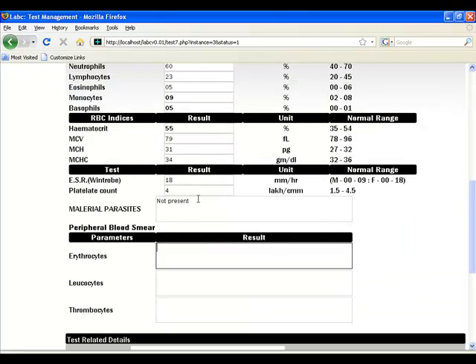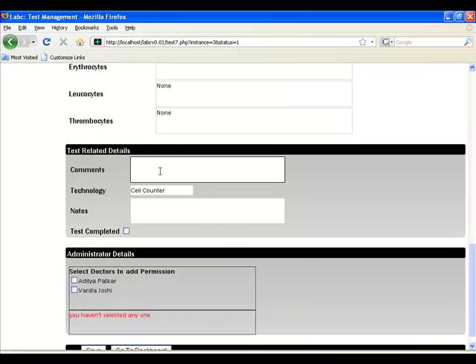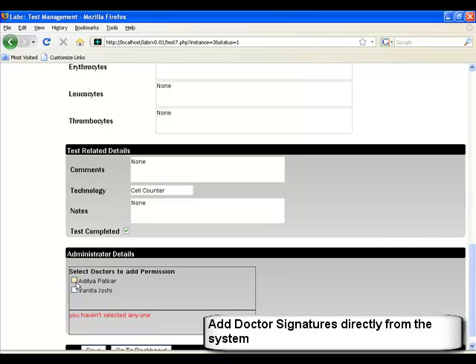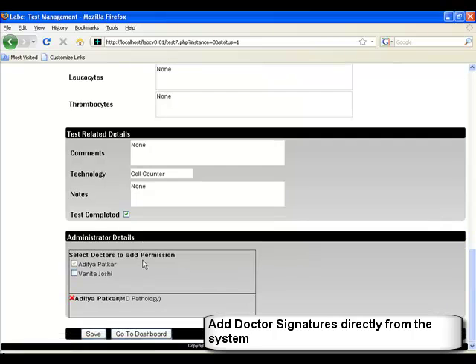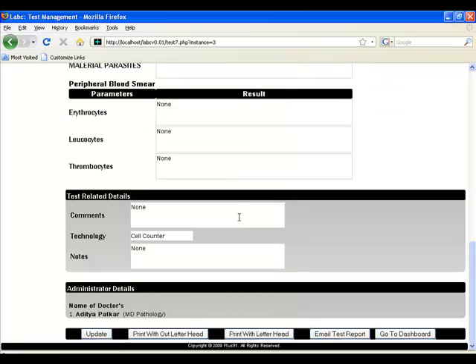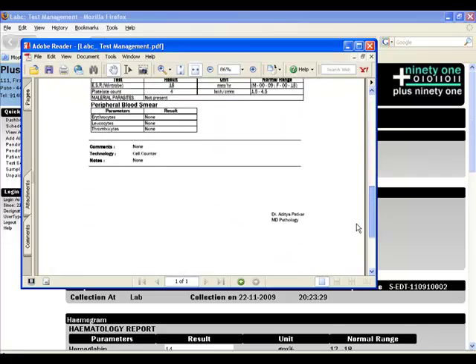As you can see, the person is entering the completed test. One very important feature in these reports is the ability to add comments and notes. You can have predefined comments and notes. Most importantly, you can add permissions and signatures directly in the software. You can scan a person's signature and attach it to a staff member or doctor. You can then select the person who needs to sign, and their signature appears at the bottom.